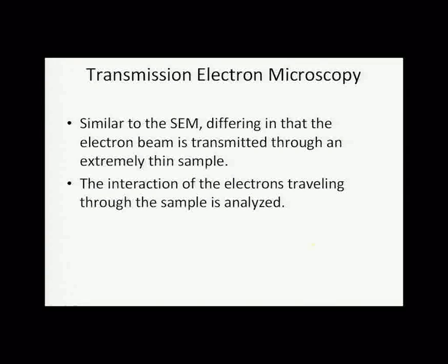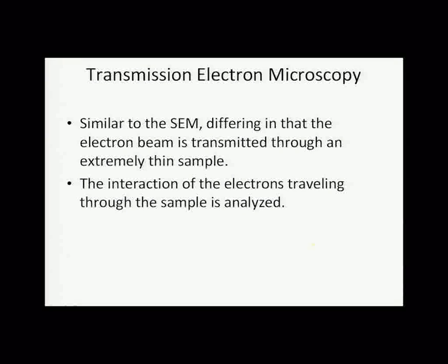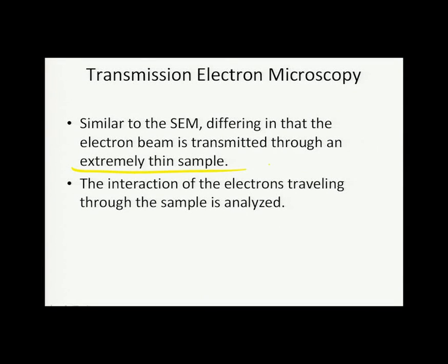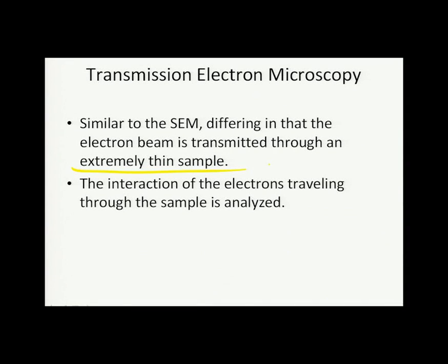So we're not looking at different things coming back from our sample. We're looking for the electron beam being transmitted through our sample, and therefore our sample must be extremely thin. So the interaction of the electrons traveling through the sample will be analyzed. This is TEM.